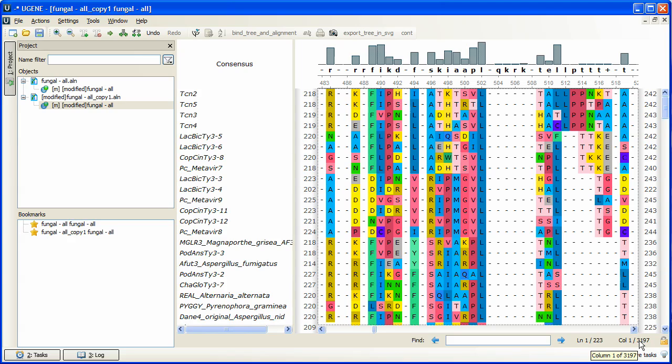Also, it was calculated four times faster. And it's worth mentioning that K-Align is able to deal with alignments containing more than one hundred thousand sequences.